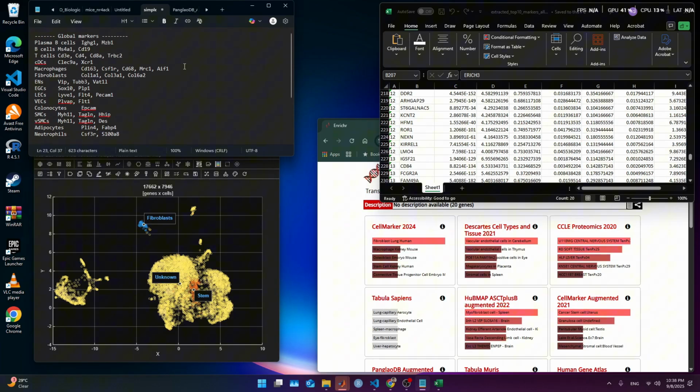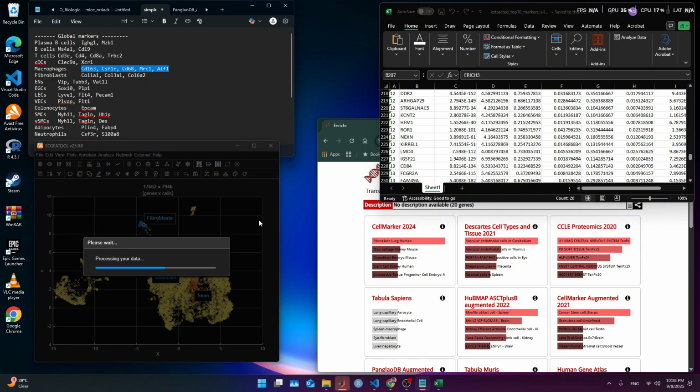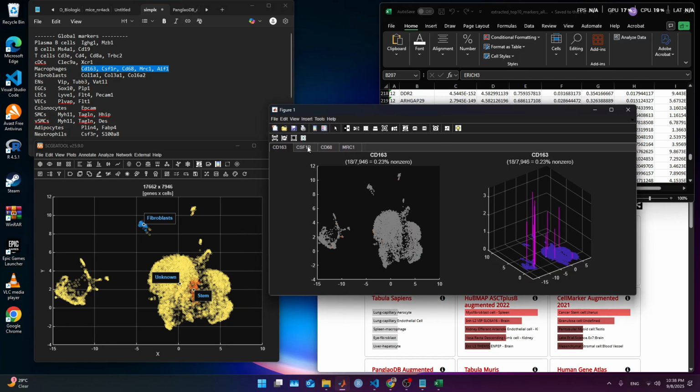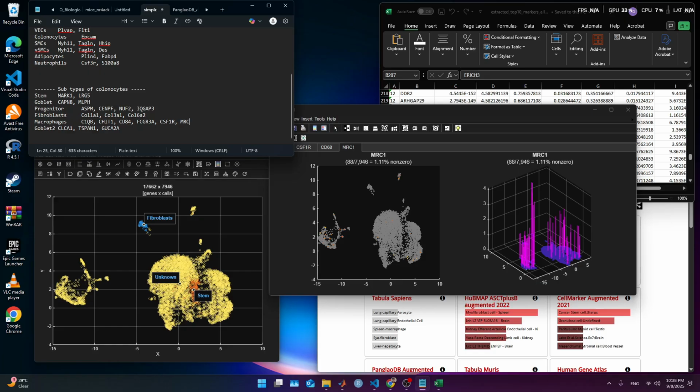Now I'm gonna use my previous markers and see if any of those light up properly. Paste. Then we get this. Nope, it's not lighting up nice. That maybe I'm gonna bring it to the macrophages I'm building here. Then CD68 is not helping. MRC1, it's kinda and kinda not, but we can keep it MRC1.